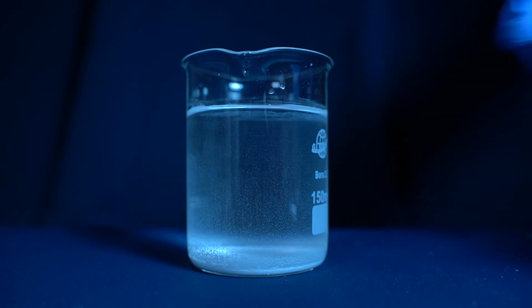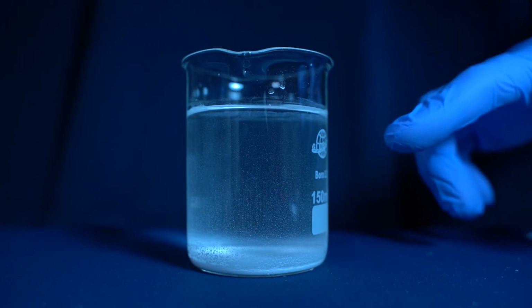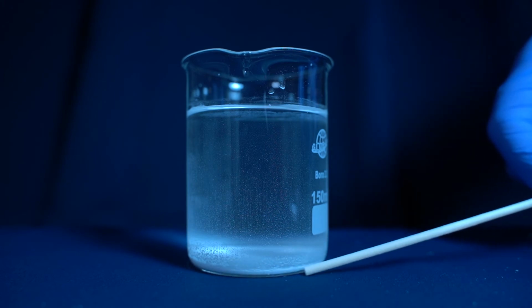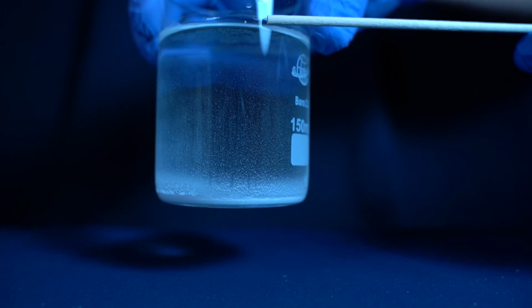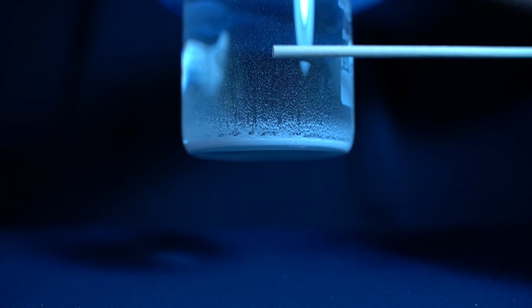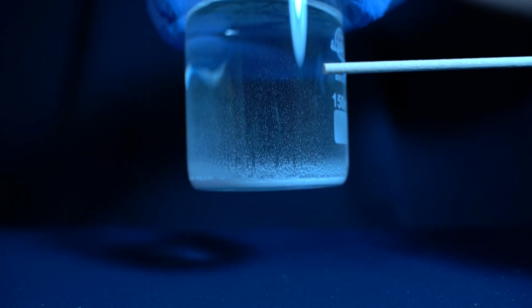All right, so check it out. This beaker has been sitting here for over 24 hours. And notice how all the white precipitate has settled to the bottom of the beaker. Most of this is transparent liquid, but the bottom is that white precipitate that we saw earlier. And it has settled down to the bottom because it did not dissolve in the water.